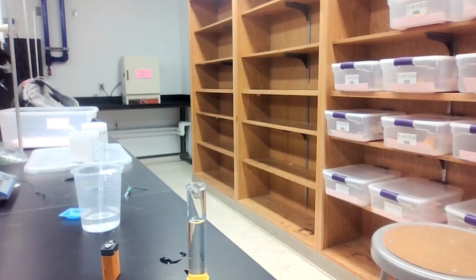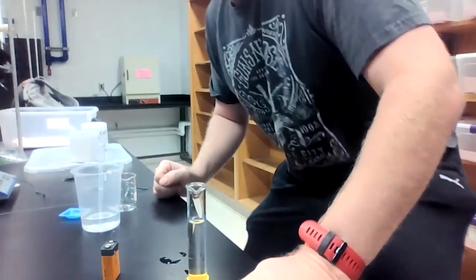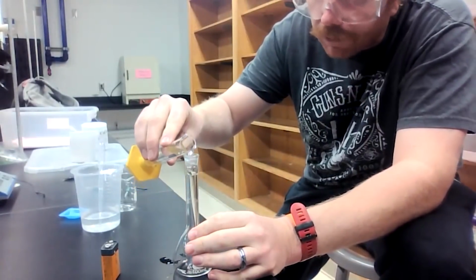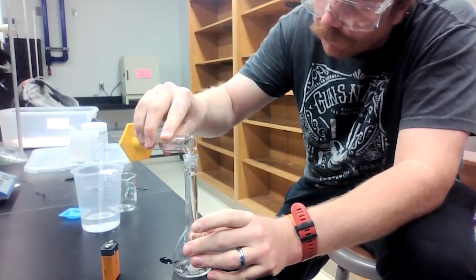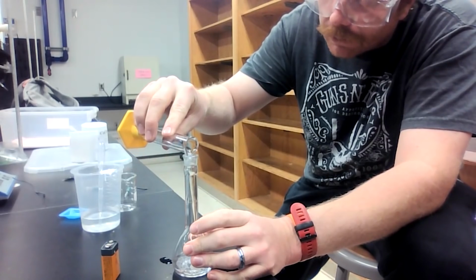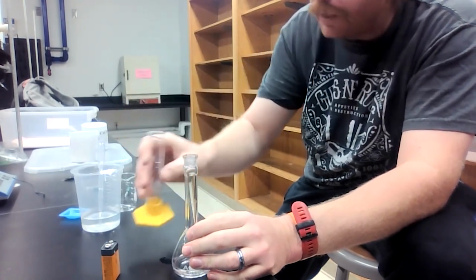Okay, I put this back on because, okay. Now I'm going to transfer my 25 milliliters back into my volumetric flask because I want to add 75 milliliters of deionized water.